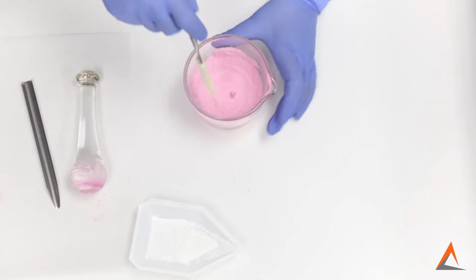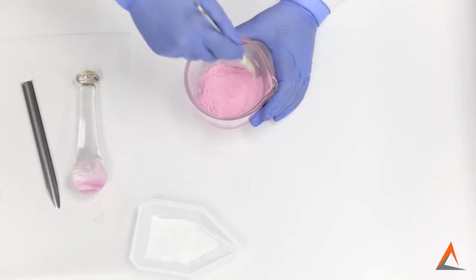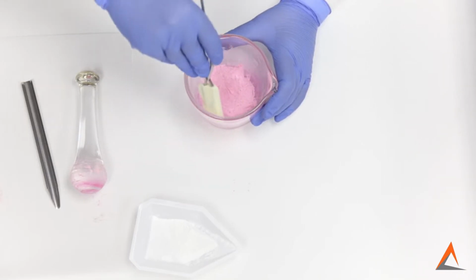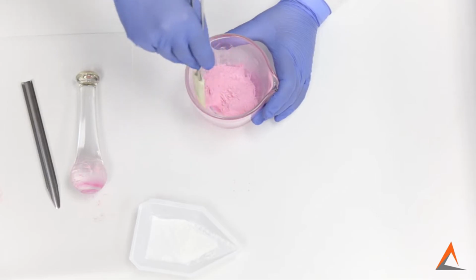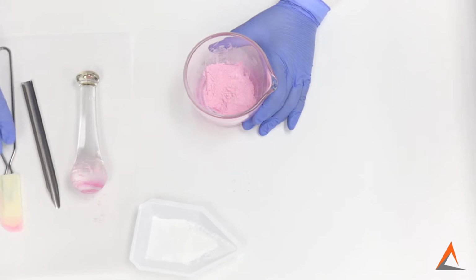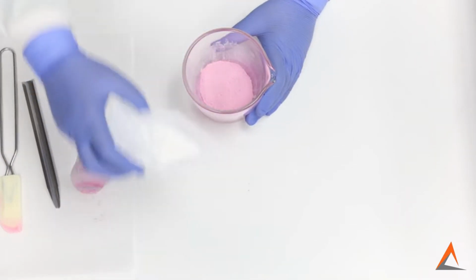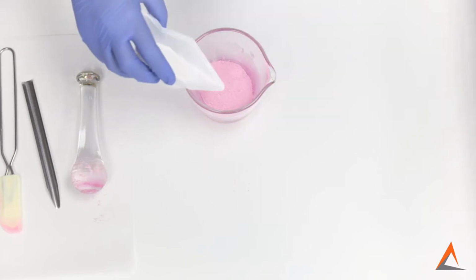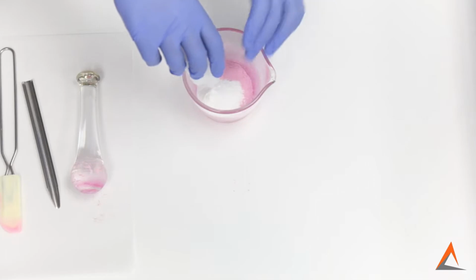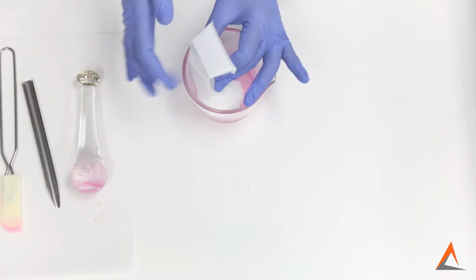That's why these soft rubber or silicone spatulas are really nice to scrape down the sides of our mortars. You can get full contact with your mortar without scratching or damaging your glassware. Now, we're at the last addition as we're going to add all of our remaining lactose to the mortar. With these larger weigh boats, it works well to hold them by the corners and pinch them together to fold them in half and tap the sides.